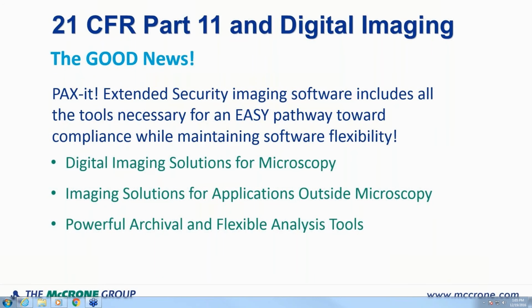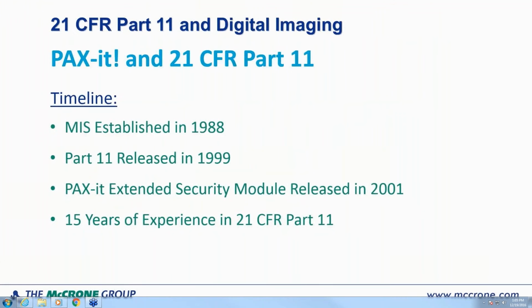Today, in this short webinar, we will present to you PAXit Extended Security, an imaging and software package that enables customers to meet the challenges of 21 CFR Part 11 compliance with greater ease and flexibility. While our emphasis will be on imaging and microscopy for FDA-related procedures, please keep in mind that this package can apply to other various imaging applications outside of microscopy. I will now hand the mic over to Adam, who will take us through a brief review of PAXit Extended Security and its abilities to help your lab comply with 21 CFR Part 11.